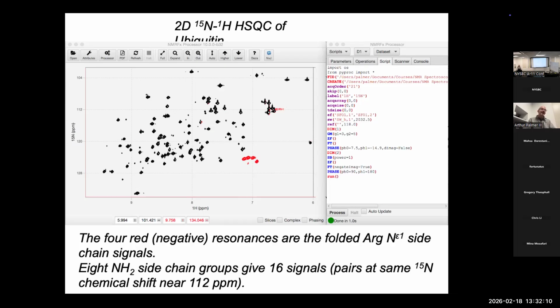It would be more common today, if we knew we wanted, for example, CH2Ds, to just use precursors in the E. coli biosynthetic pathway that we can feed that are labeled in that way and that then go directly into the methyls.